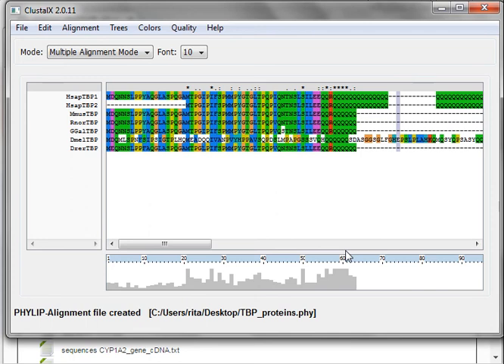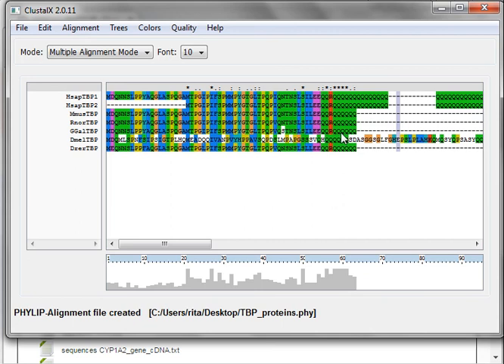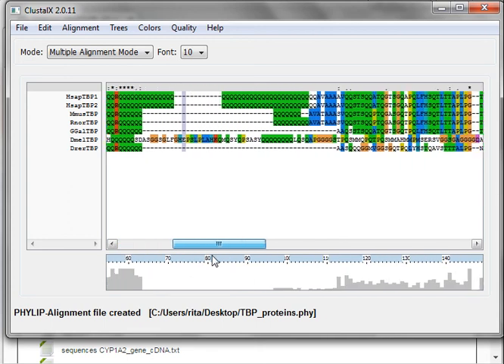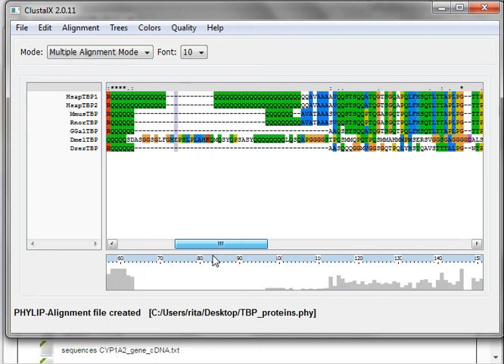Now that you check the multiple alignment, you can go and observe the multiple alignment in different forms. For example, using WebLogo, if you want to light out the identical areas of the alignment. Otherwise, you just want to see the relationship between the organisms so you can follow to Phylogeny. Phylogeny is the object of study in lesson number six.